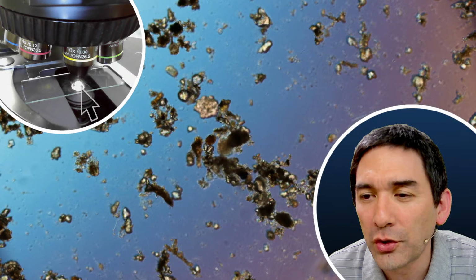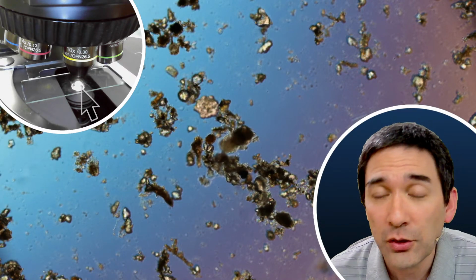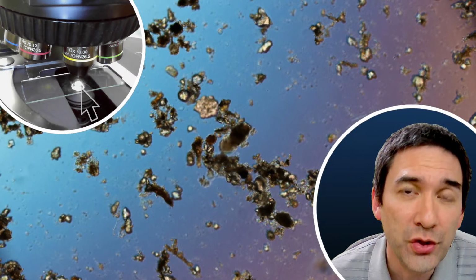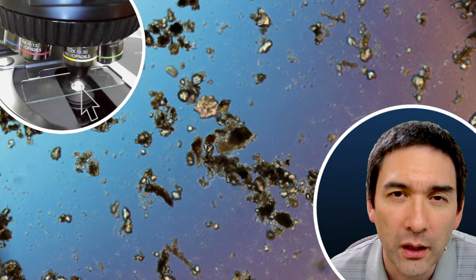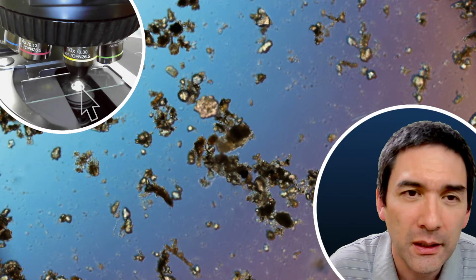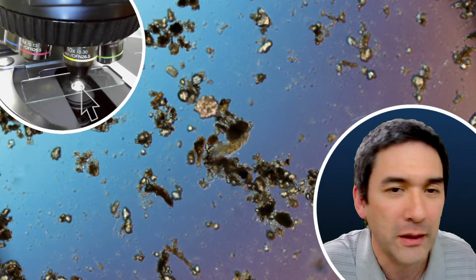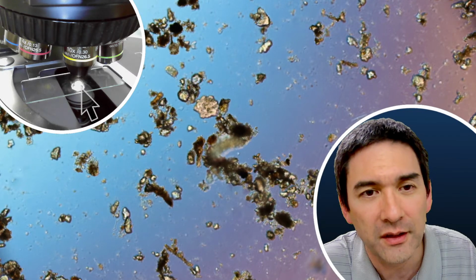Just use soapy water to clean my slides. Yes, soapy water, hot water also works. Just make sure that if you use soap or any detergent, that you really rinse it very well. That's important because even small amounts of soap can actually harm the microorganisms. Yeah, because it's a detergent and it dissolves the membrane.